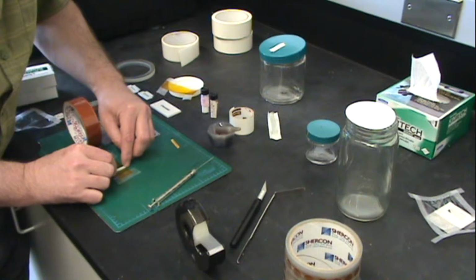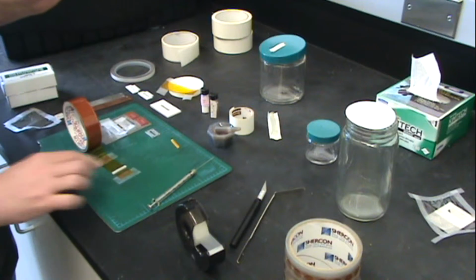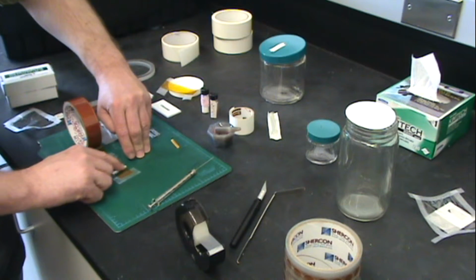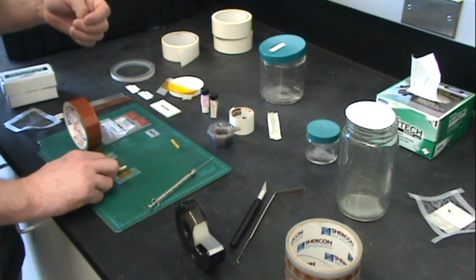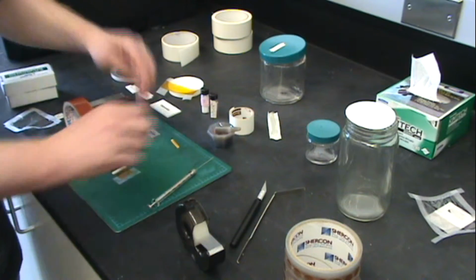The tape is 1 inch wide, the sample cell is 1 inch wide. Put on the tape, push it down. There's a little thin wall, and then at the beginning and the end there's a little piece of this polycarbonate, or I think it's another material, Delrin material, which is going to stick, and you can feel it. It's actually very nice.